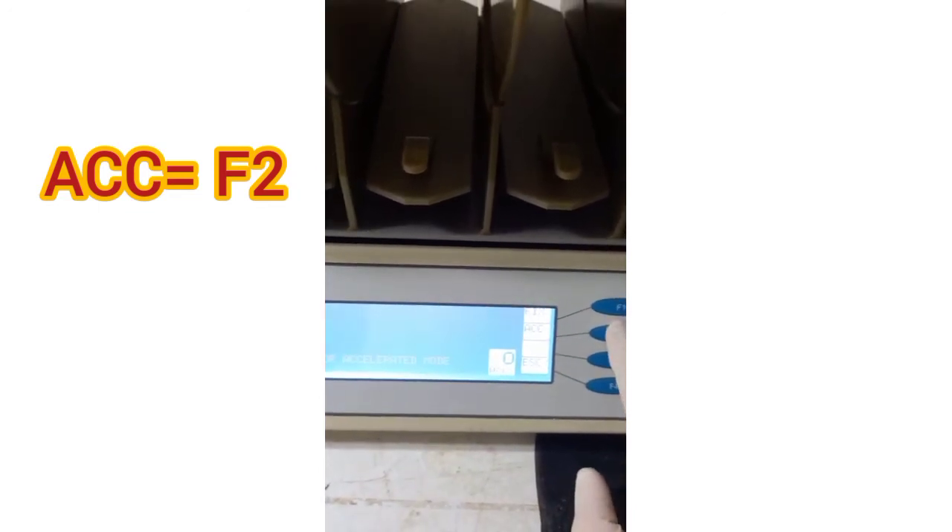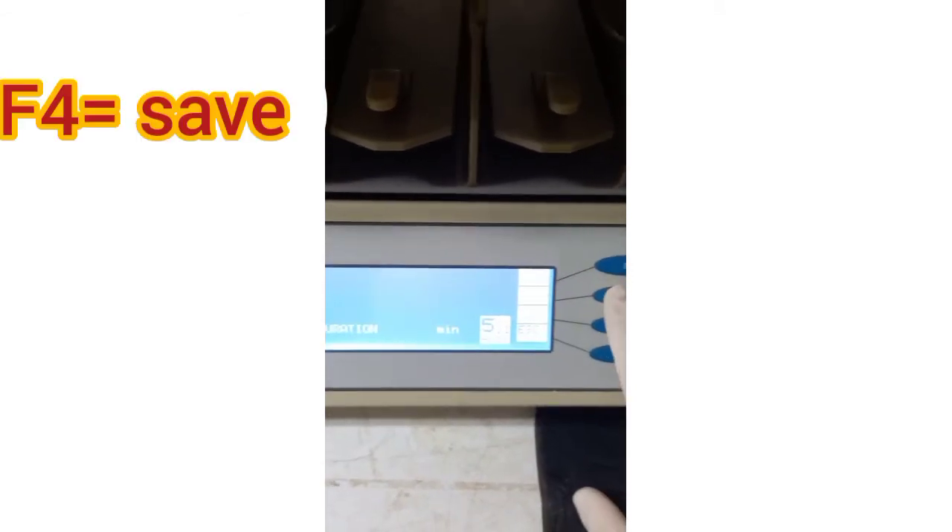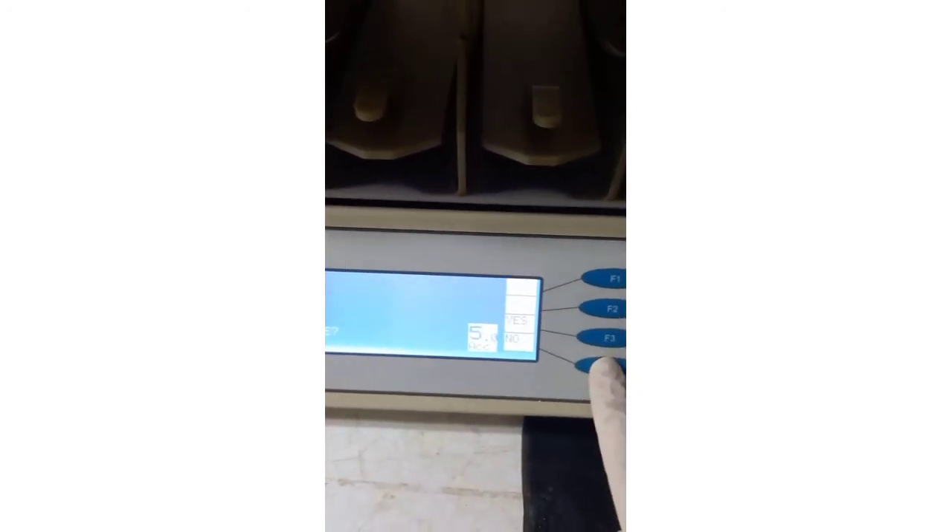You can press F1 for constant speed or F2 for acceleration. Here, let's select F2 for acceleration. Now set the ramp duration — the maximum latency is set at 300 seconds per trial, so let's set it at 5 minutes. You can adjust this time based on your experiment. Save the duration by pressing F4. Then you have the reverse option mode — if you select yes, once the top speed is reached, a deceleration phase will start, meaning the rotor will return to initial speed.